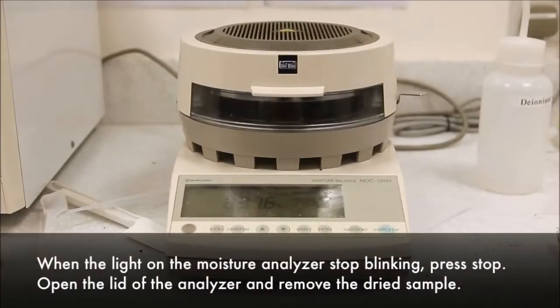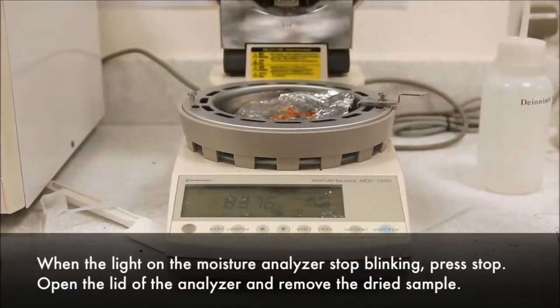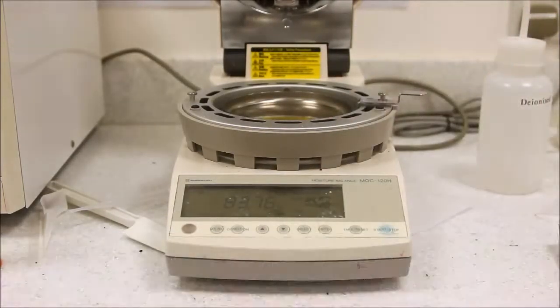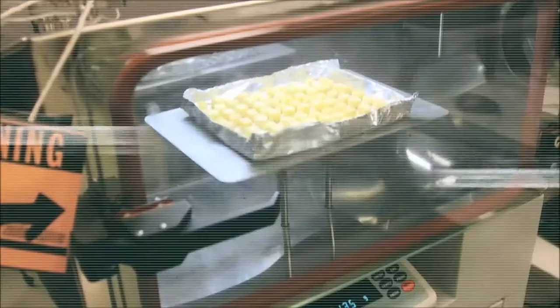When the light on the moisture analyzer stops blinking, press Stop. Open the lid of the analyzer and remove the dried sample. Record down the value as the initial moisture content of the sample on a wet basis.